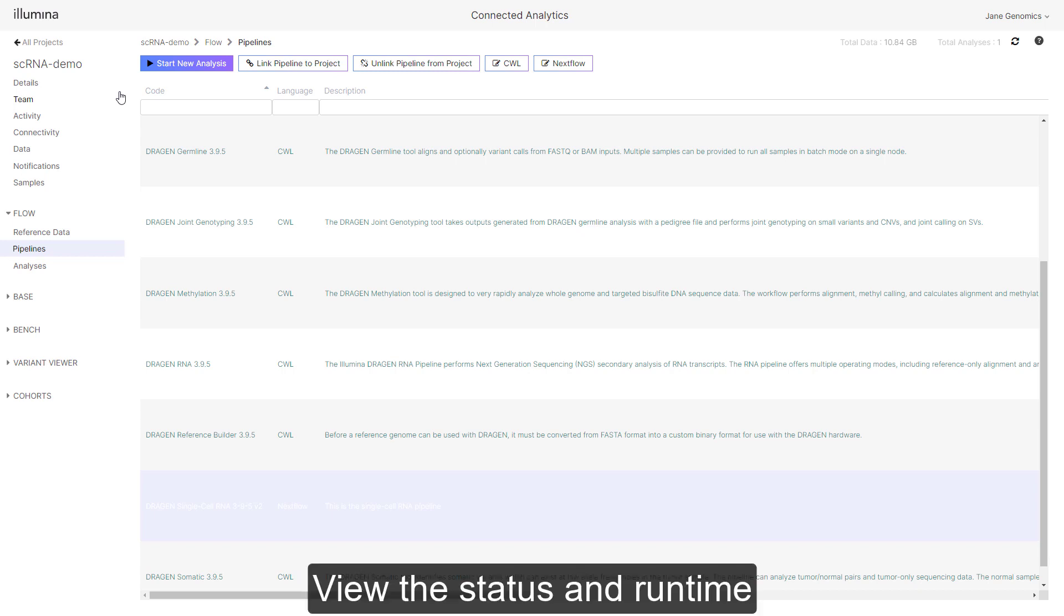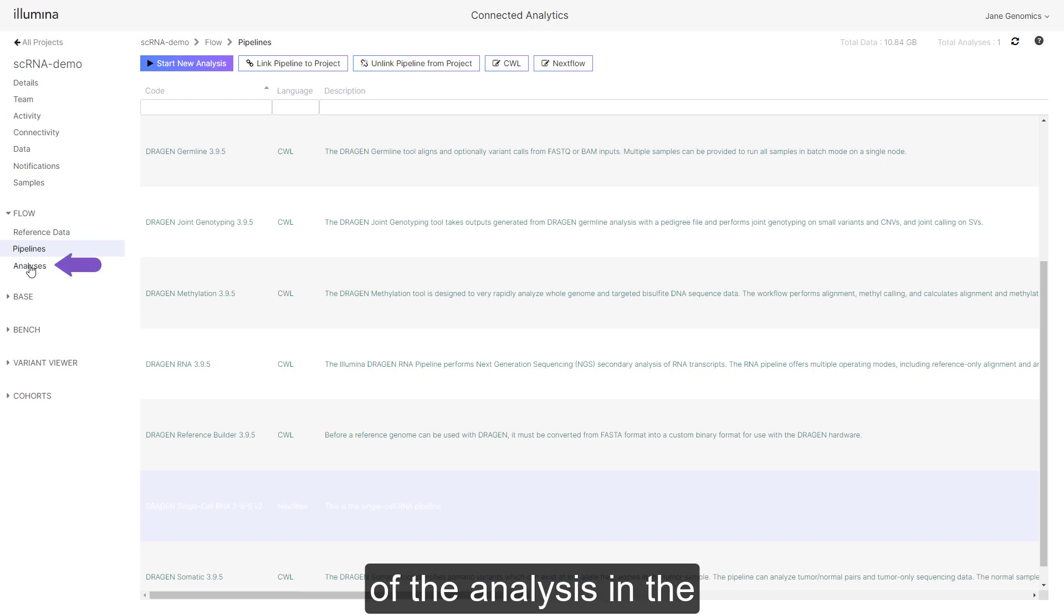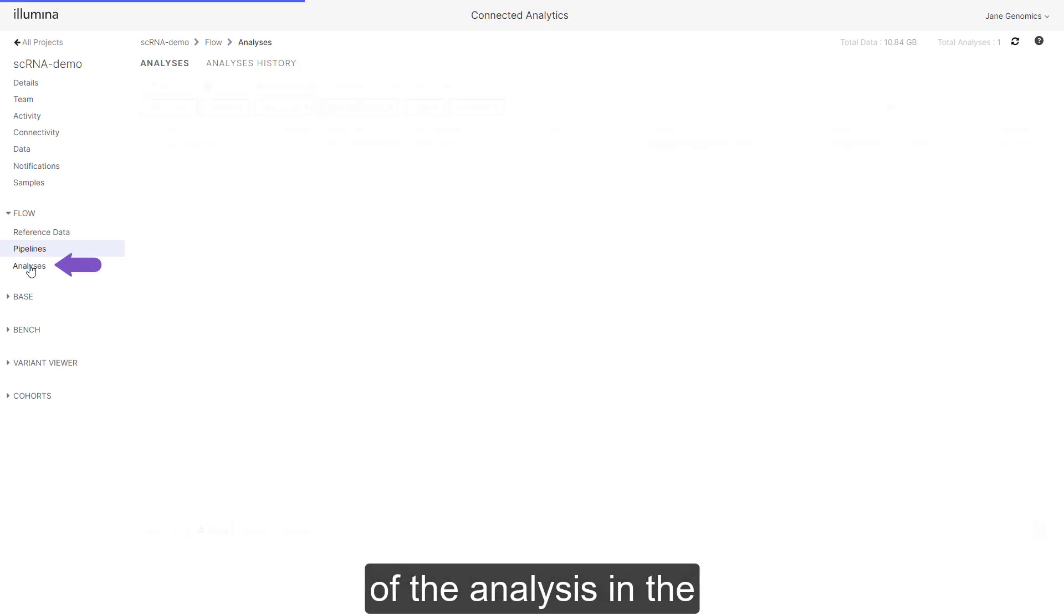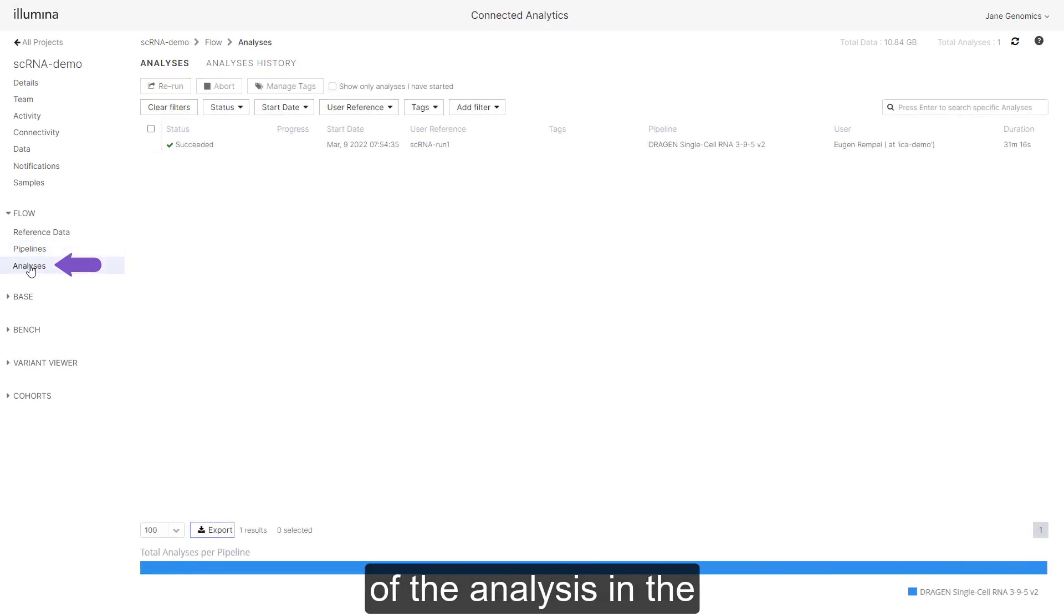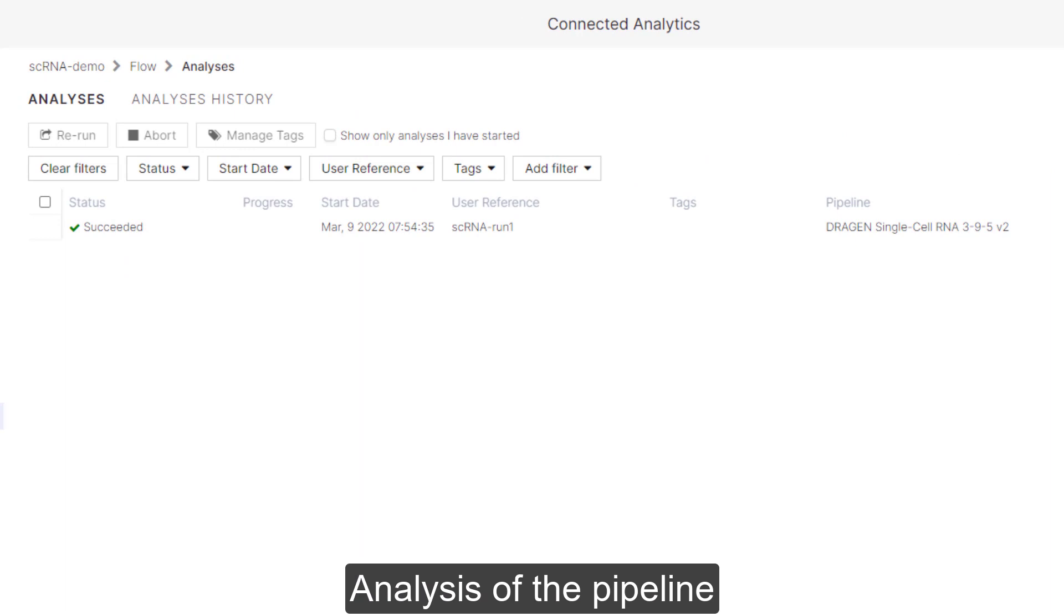View the status and runtime of the analysis in the analysis page of ICA flow. Analysis of the pipeline was previously completed.